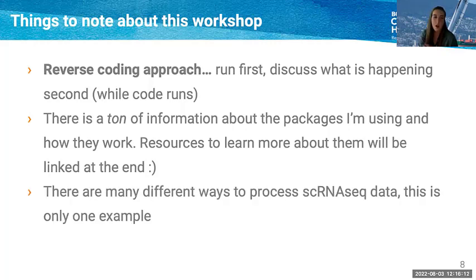There's a ton of information, but we do have the time for you to stop and ask questions as we go through. There are many different ways to process single-cell RNA sequencing data. There are a lot of publications out there comparing the many different ways to process it. Here's another package, so you can process it this way, and oh, here's a spin-off of that package. So there's a million ways. I'm showing you just one.